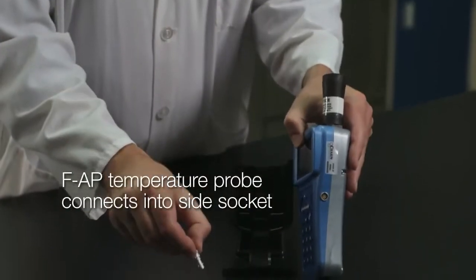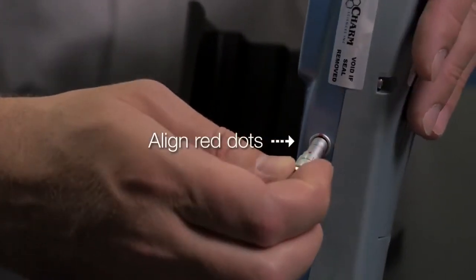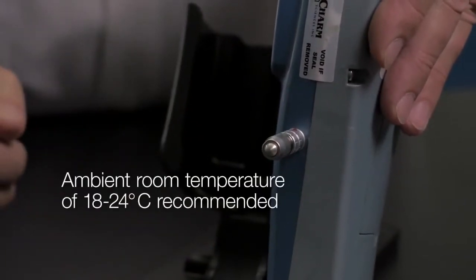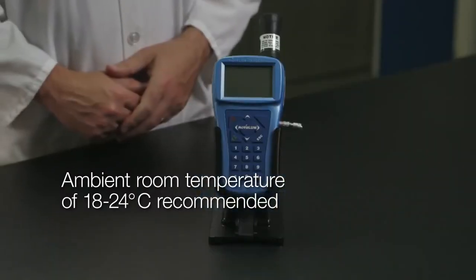The FAP temperature probe connects fully into the side socket on the Novolume. Align the red dots as shown and press in to connect. The probe measures the ambient room temperature to make sure it is between the recommended 18 to 24 degrees Celsius needed to run the FAP test.